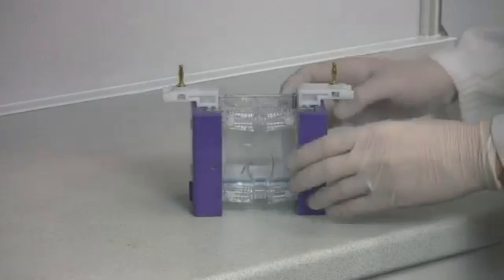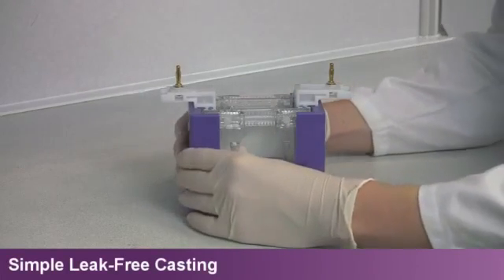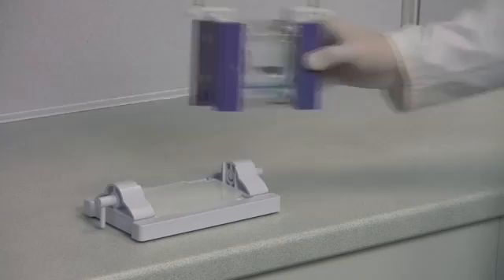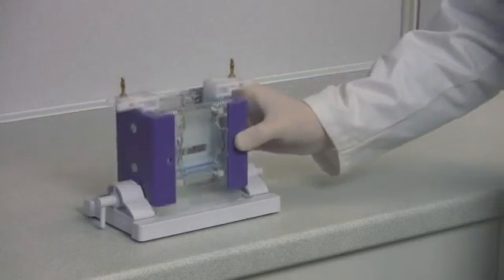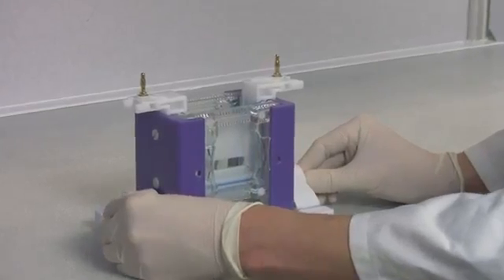The unique sliding clamp technology of the Page Insert ensures simple, rapid, leak-free gel casting. The ultra-soft molded silicon mat acts in tandem with glass plates and bonded spacers to provide a leak-free seal.